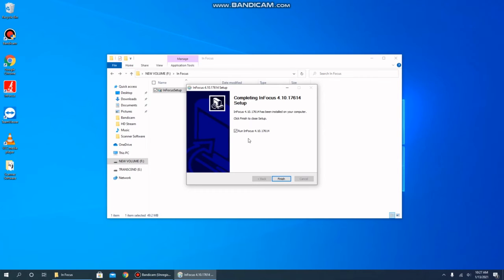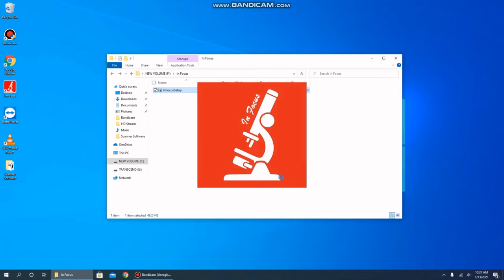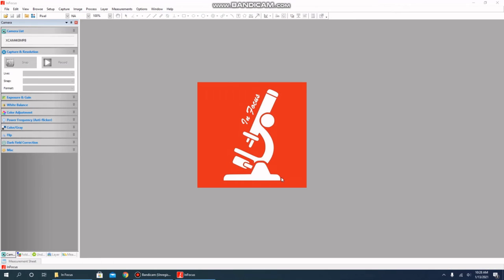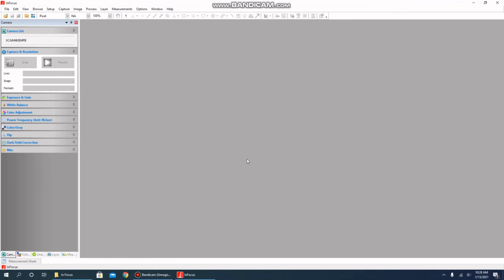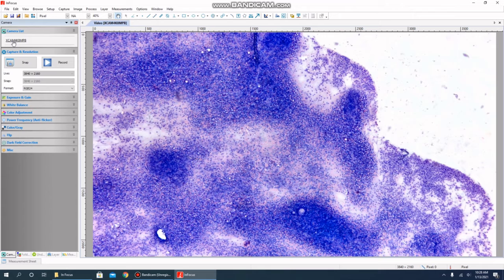If that's ready to go, we're going to click Finish, which, if you have this checkbox marked, will run the InFocus software automatically. When the software launches, look in the upper left-hand corner — you will find your camera list and locate the camera that you wish to view. A single click on that camera will bring us to a live image.